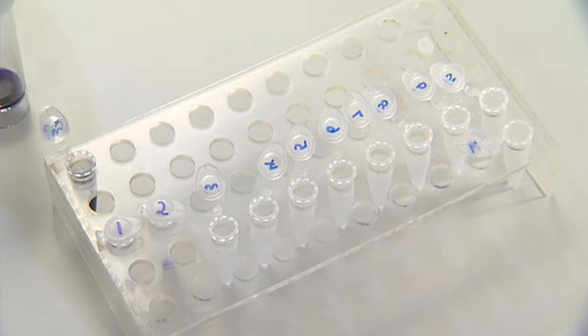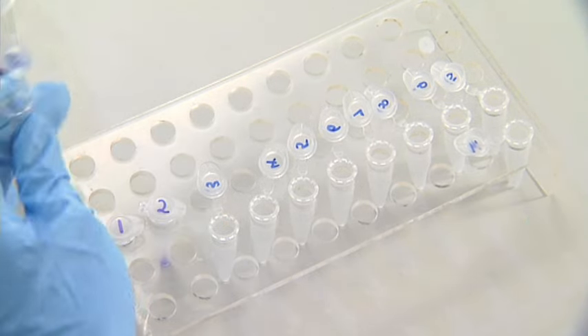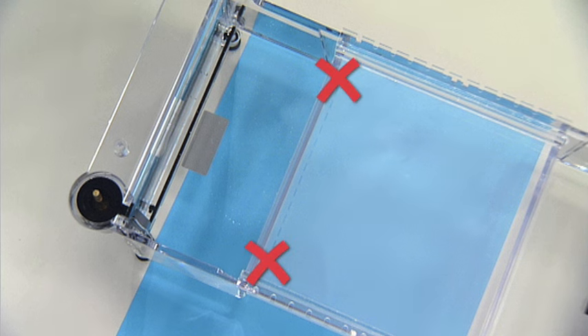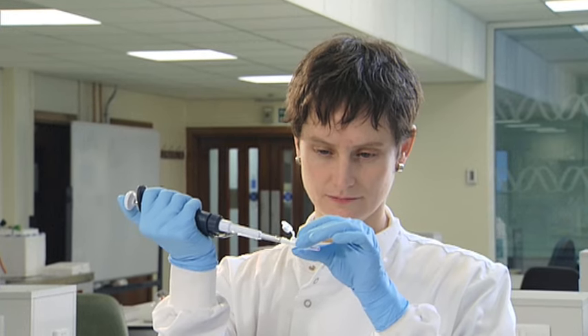Ensure the loading buffer and the sample are mixed so the solution has a uniform colour. Arrange labelled tubes containing samples in the same order that they'll be loaded into the wells. If there are more wells than samples, avoid using the outermost wells, as samples loaded on the edge of a gel tend to run less consistently than those loaded closer to the centre. The volume of sample loaded into the wells will depend on the capacity of the well — 10 to 20 microlitres is typical.